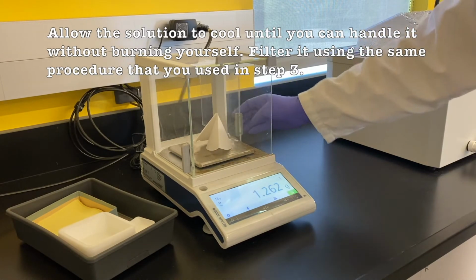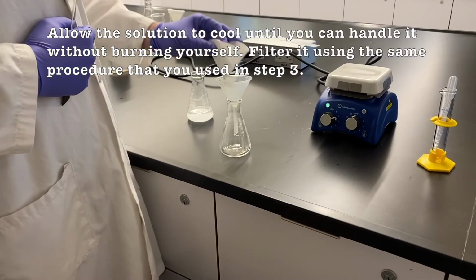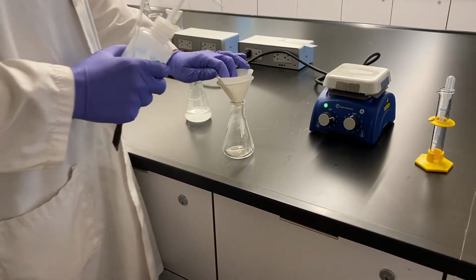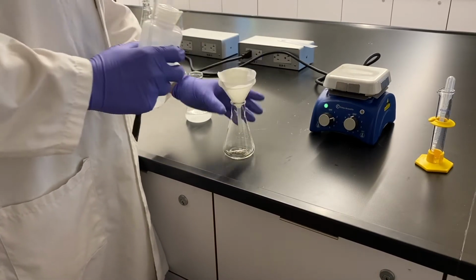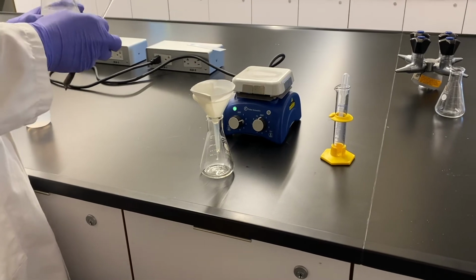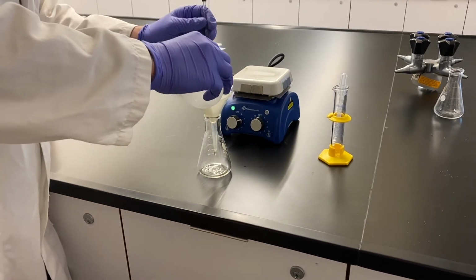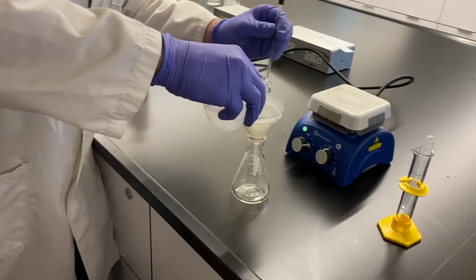So we're going to mass a different piece of filter paper because our calcium carbonate that we just reformed is going to get on there, and we'll dry it off again in the oven just like before. Our filter paper will just have calcium carbonate, and you subtract the mass of the filter paper, then you just have the mass of calcium carbonate. Perfect. And again, this time we're using an Erlenmeyer flask to hold the funnel, so we don't have to hold it with our hands.